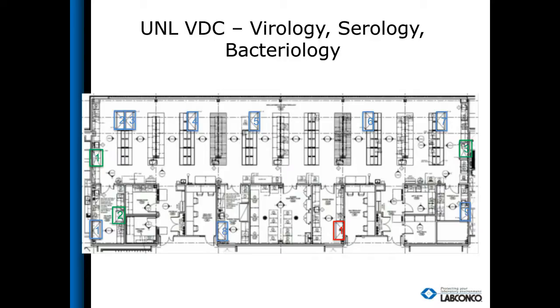What often happens in laboratory design is that lab designers fall into a trend, or become entrenched in the concept that without proper guidance from the facilities design crew, they don't know what cabinets, or how many cabinets, need to be recirculating or exhausted. So often, instead of guessing, they'll ask the design team. The design team hasn't necessarily spoken with the lab managers and actually seen the SOPs to know what they'll be working with, so they usually just assign a number to it.